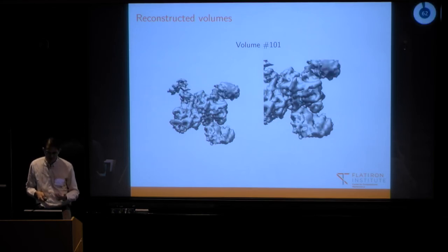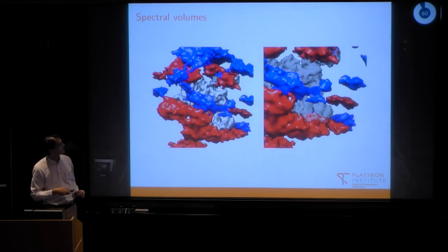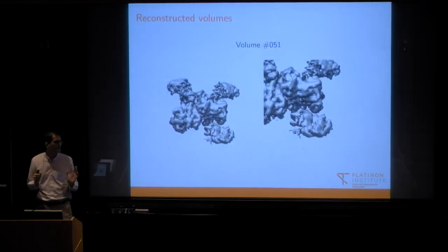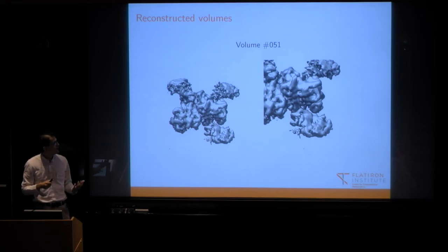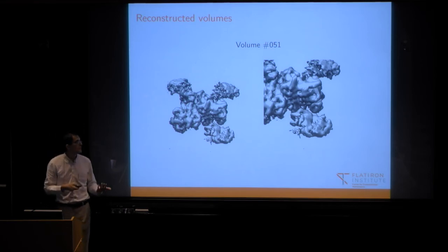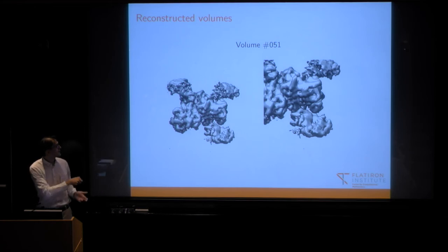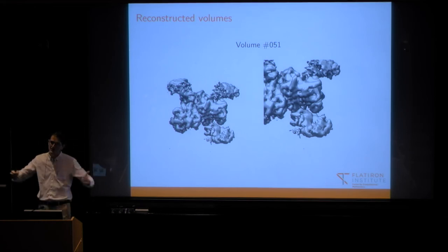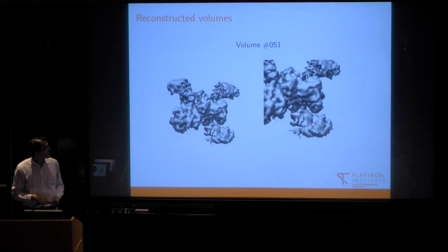And that's kind of the challenge right now, looking at what we can do to improve these things by regularization, by focusing things. Part of the reason that we get a lot of this noise is that we're not really putting any priors on here. We're not saying, oh, this variability should be localized in these regions, or it should have a certain smoothness. The only parameter that we're putting in is how many eigenfunctions we are using to describe this manifold function. So that poses some smoothness conditions. But otherwise, we're just kind of estimating these volumes. So part of the work going forward will be implementing priors and making sure that these things don't pick up too much noise. Because when you're estimating 16 volumes instead of 1, noise gets spread out a lot more. So that's something that we're looking at.